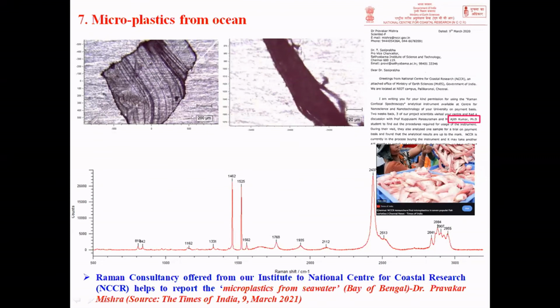So you can see the optical images of a very tiny substance, and the focus should be there. And if you focus on a particular area, you can even do the mapping here, like if it is polyethylene, it can be a polybutylene. So that kind of differentiation can be done if you do a Raman. So the polymeric compositions present in the microplastics are highly helpful to environmental applications like microplastics.